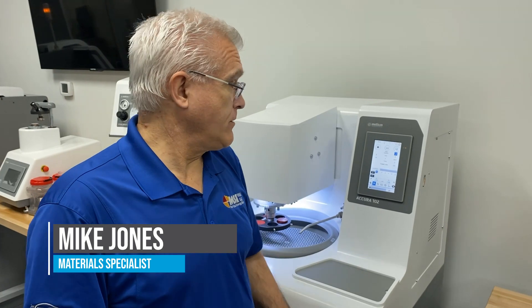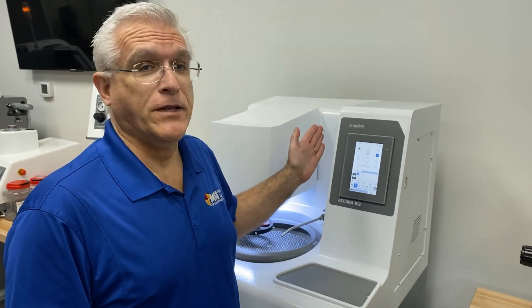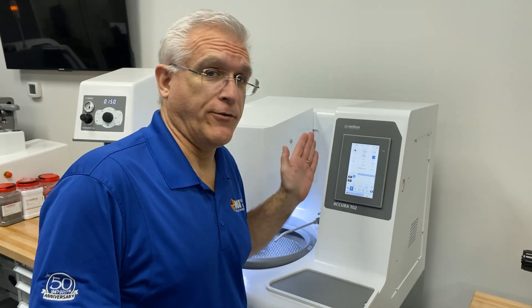Hi, I'm Mike Jones with MSI Viking. I'm a material specialist here. When it's time to prepare your samples and polish them, it's hard to beat the Metkon Accura 102.